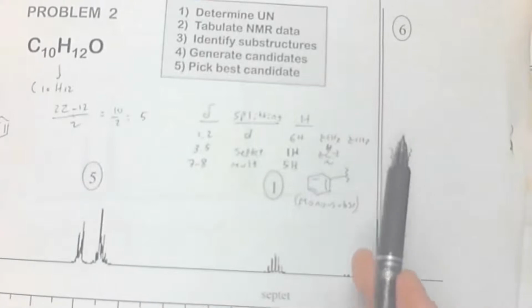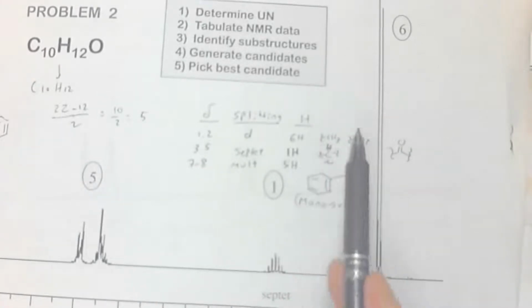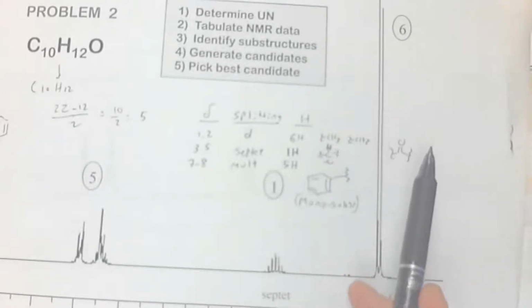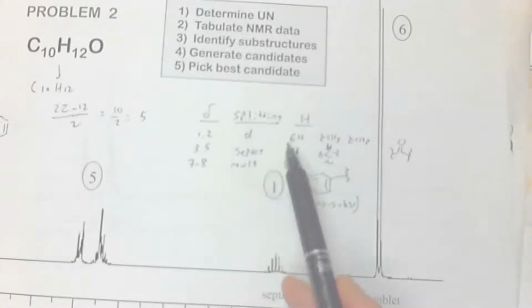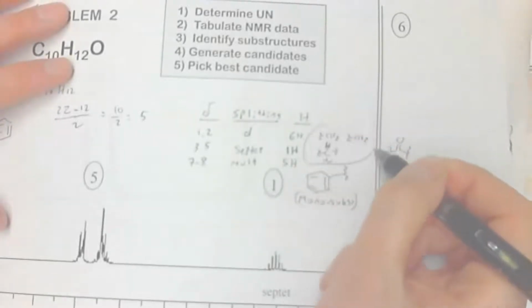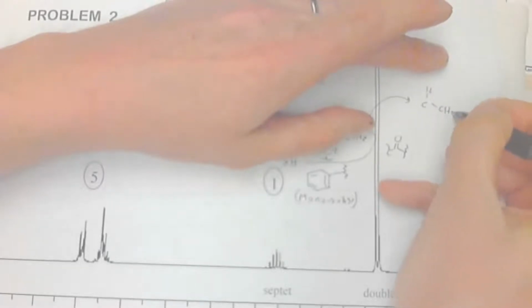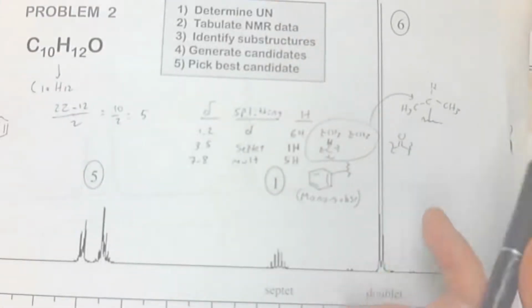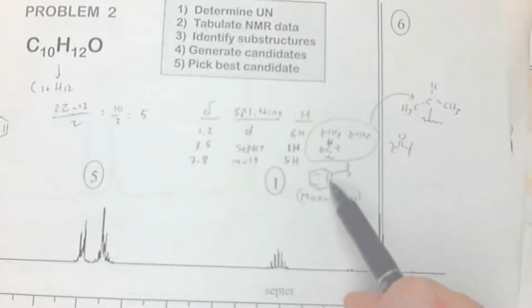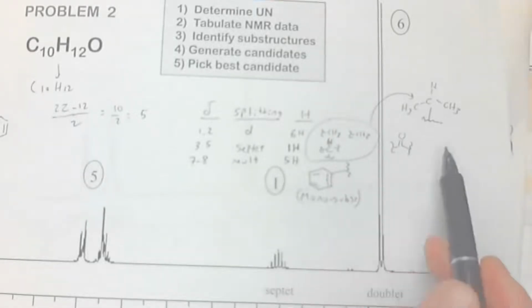All right, so now the attachment of this is really easy. It's the same strategy. The D tells you everything, right? What does it tell you about the 2 CH3s? They're connected to the CH. You got an isopropyl. It's drawn really terribly. But the answer is, now it's the same thing.